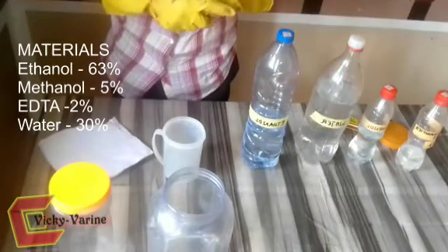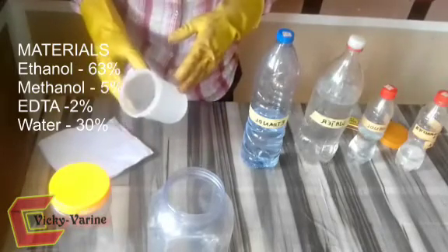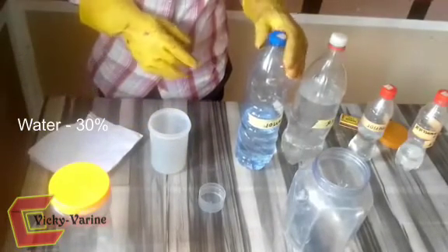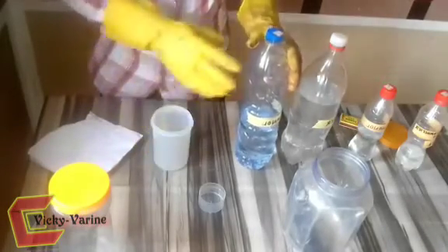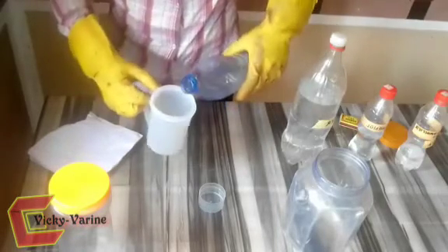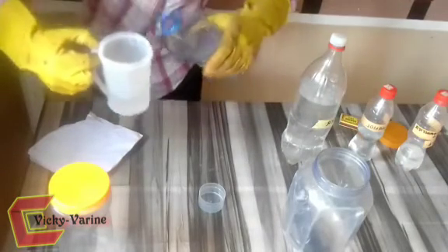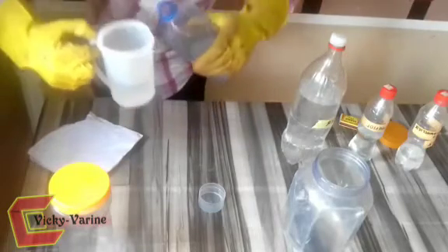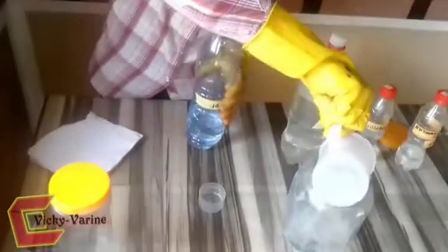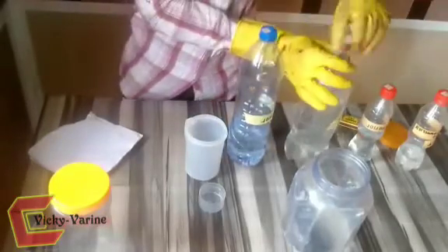You can use this measurement to make any amount of product that you want. This is our measuring cup — it is 500 ml. Now for the ethanol, we are supposed to take 63%. So 63% of 500 ml is 315 ml — let's measure that. And then the water is 30%, so 30% of 500 ml is 150 ml.